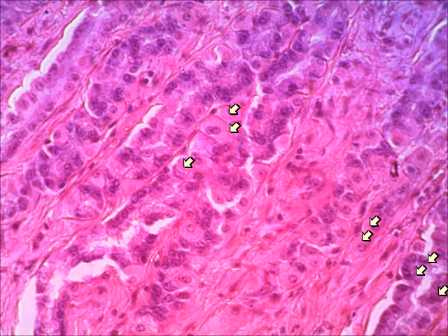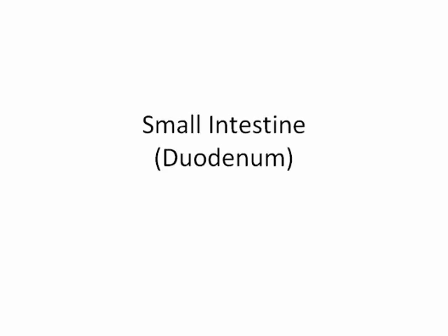So the parietal cells are pink, and that's easy to remember. Pink and parietal start with a P. And then the chief cells are the bluish stain. Again, you don't have to know the difference in chief and parietal cells for lab. For lecture, you learn their difference, not with what they looked like, but what chemicals they produced. All right, that's it for the stomach.